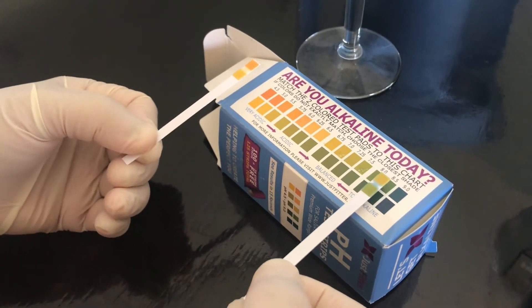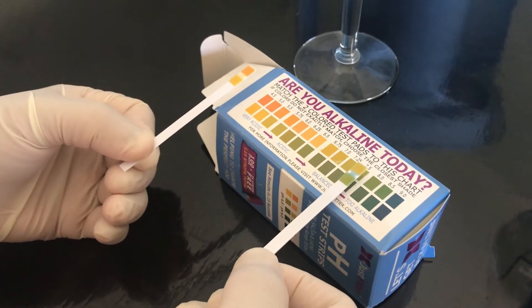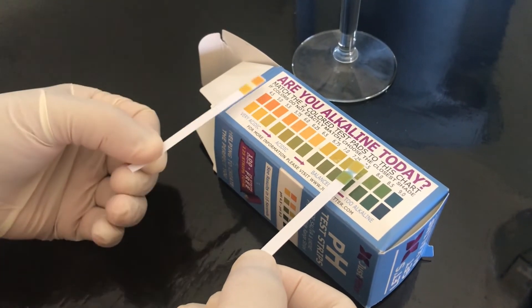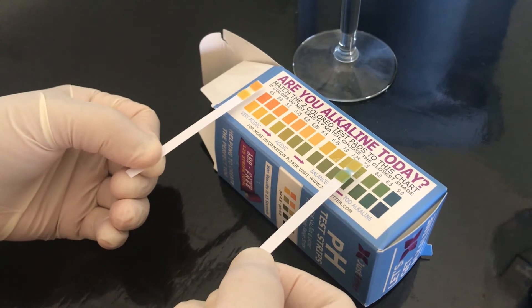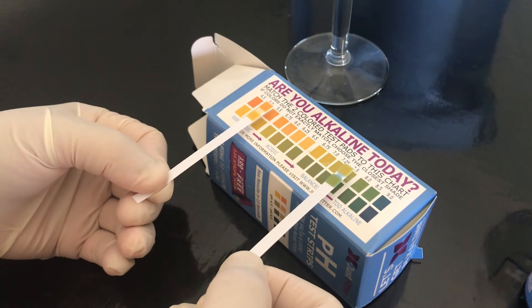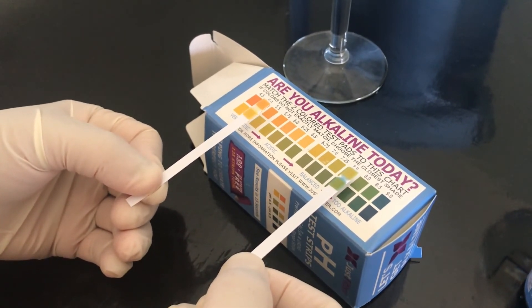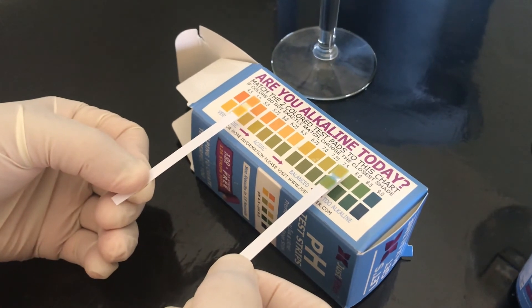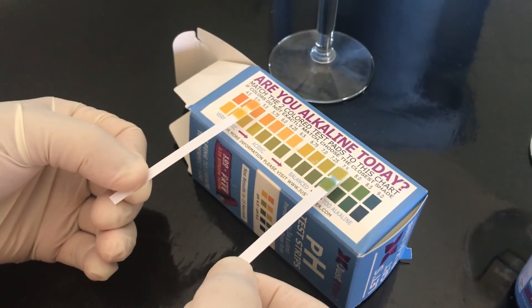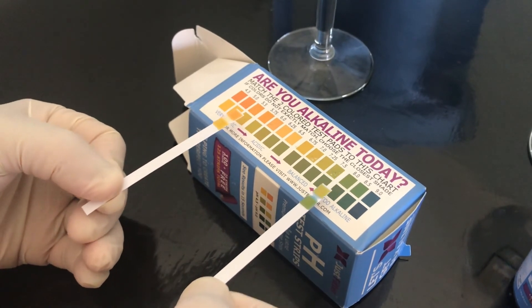Tap water is somewhere in this range, and this Zero Water is somewhere around pH 5. The Zero Water pH is about 5 and this tap water is somewhere between 7.25 to 7.5.